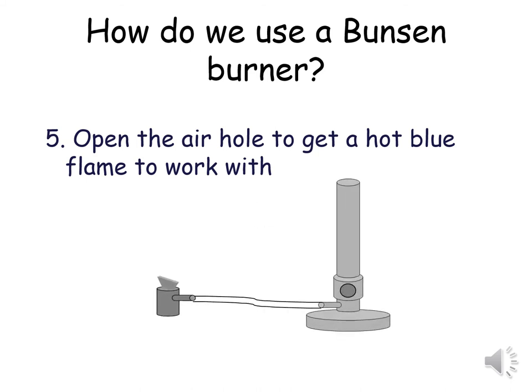So the last step that we do is we open the air hole so that the flame that we now have is a hot blue flame. And that is the flame that we work with and that we use when we are carrying out science practicals using the Bunsen burner.